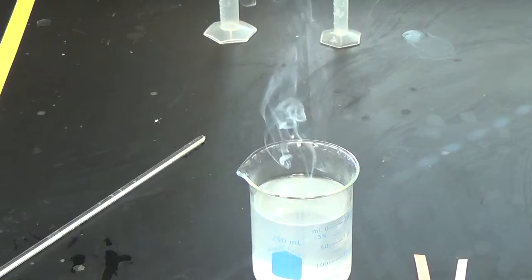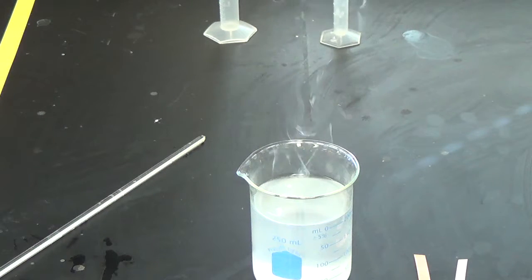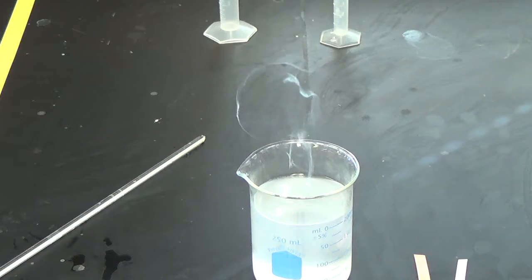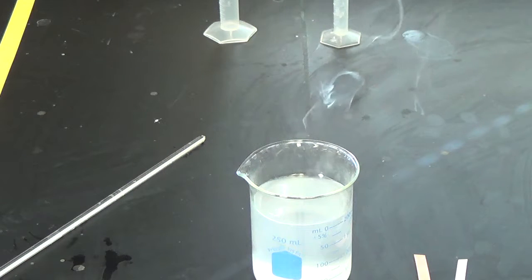Certainly the larger the piece, the more likely it will catch on fire. But you don't want to go too large as it has the potential to explode. Not that exploding sodium makes all that great an explosion. TNT is obviously better, or they would use sodium instead. But this is a safe quantity to work with in lab, and it illustrates what we need to illustrate.